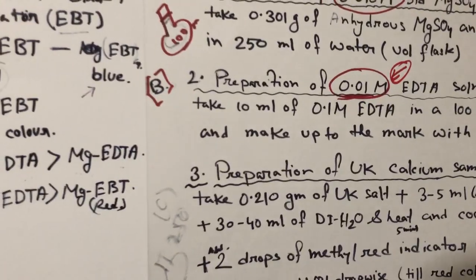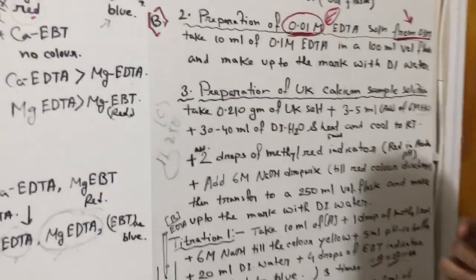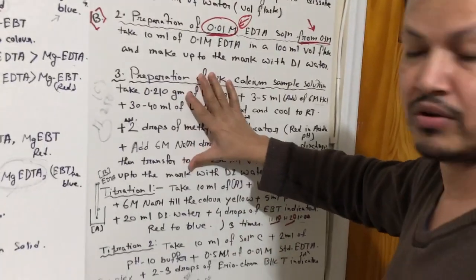Now come to the point. Now you have to prepare the unknown solution.